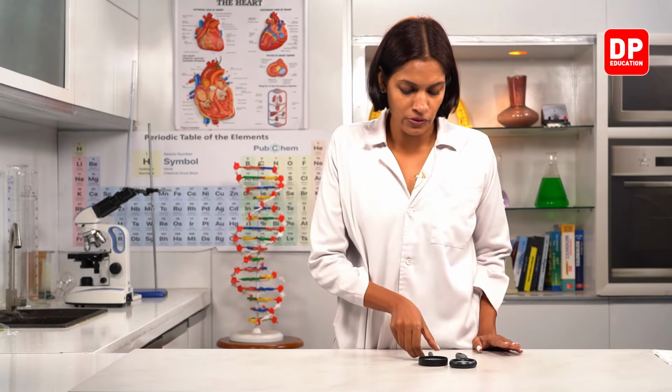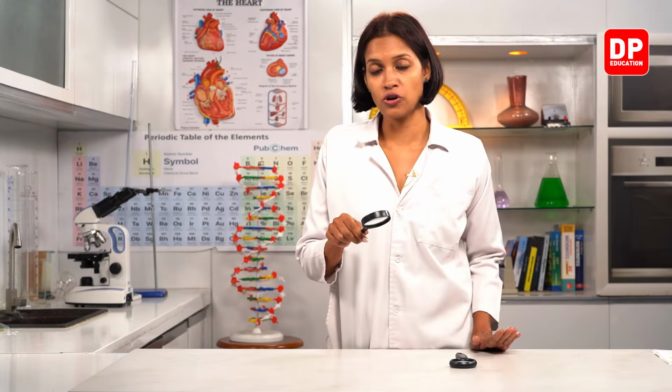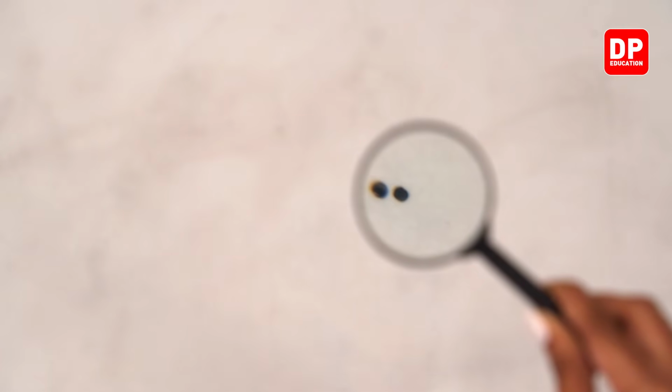Now I am going to use this hand lens to observe these two dots. Let's see what happens. Now you all can see very clearly that the distance between the two dots is larger this time. The gap between the two dots is larger. And what can you tell about the magnification? You can see the image larger than before. Right, children?